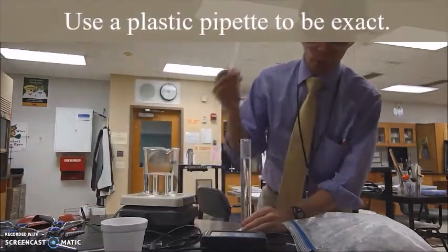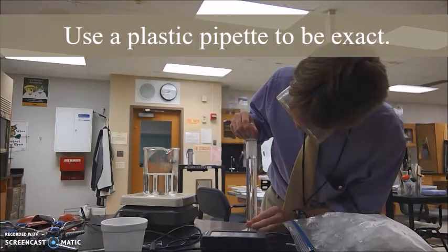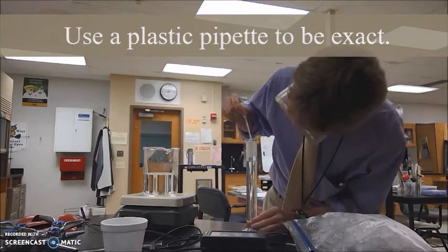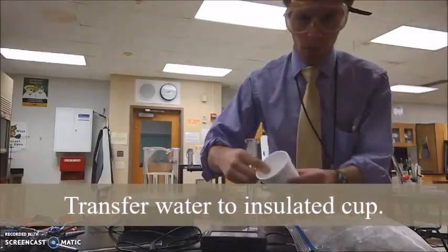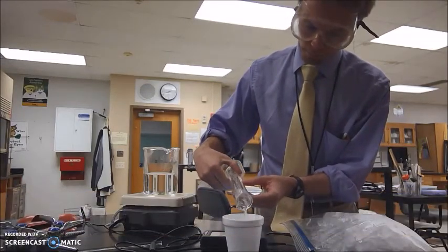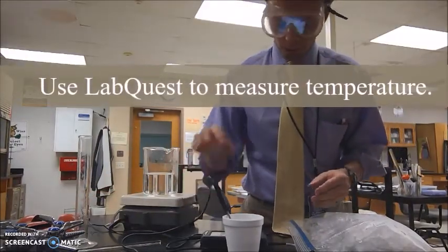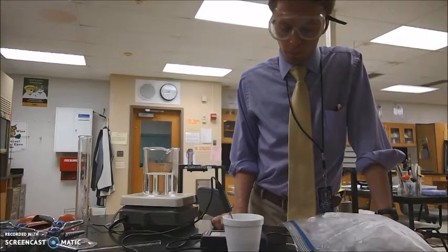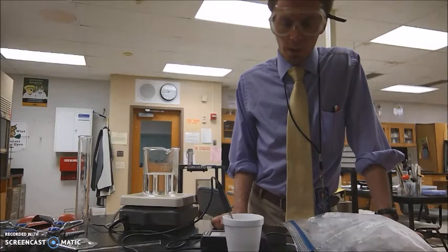I went a little bit over, so I'm going to use a pipette to help me get to 100 milliliters. Now that I have 100 milliliters of water, I'm going to transfer it to a styrofoam cup. Then I'm going to stick my vernier probe in it and record the temperature. My temperature appears to have leveled off at 55.3 degrees Celsius. So that'll be my starting temperature.